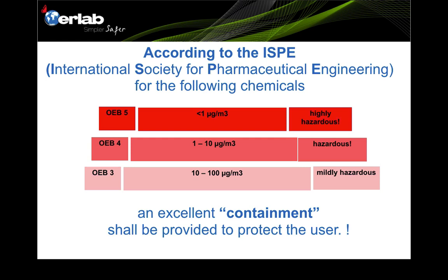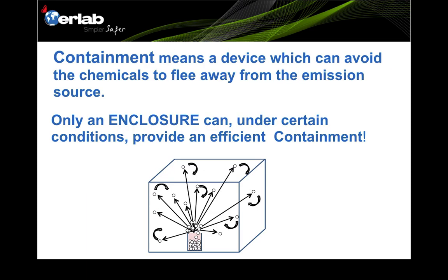According to ISPE, the International Society of Pharmaceutical Engineering, any OEB greater than 3 — meaning OEB 4, 5, and 6 — requires an enclosure and containment to provide protection to the user while doing measurements. Containment means a device which can prevent the chemical powder from freely escaping from the emission source. Only an enclosure can, under certain conditions, provide efficient containment to protect the user.